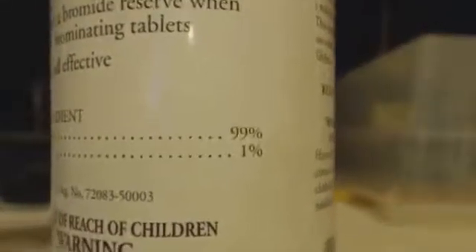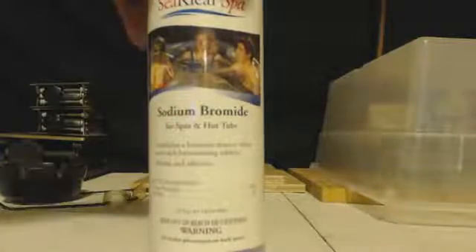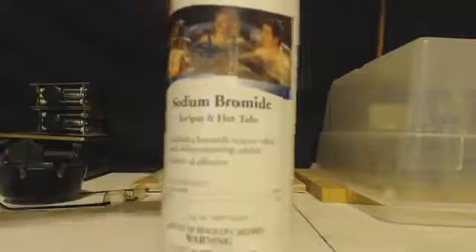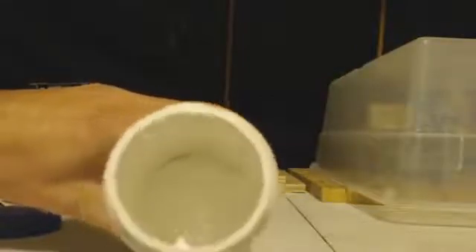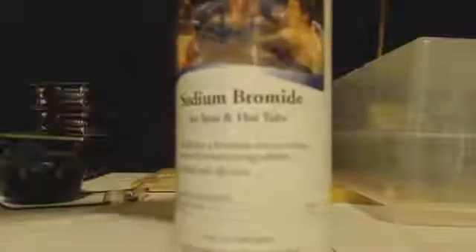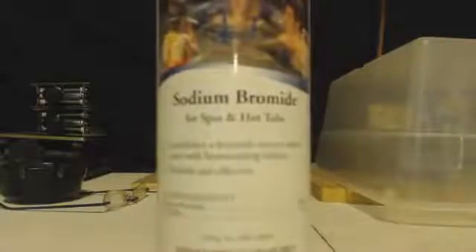I haven't looked up the MSDS, but that's pretty pure. If you open the bottle up and look inside, it's all white — looks like snow. I'm sure if you recrystallize this, you would easily end up with very, very pure sodium bromide with one recrystallization. If you don't know what recrystallization is, just give me a post and ask me. Anyways, always remember — science is great!